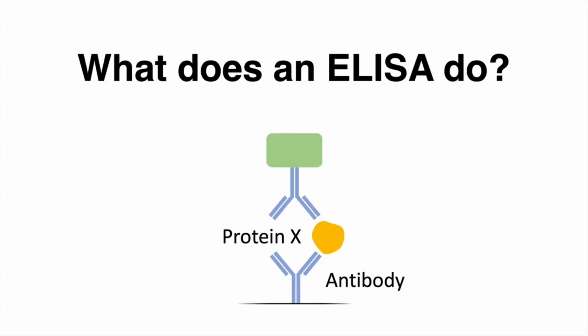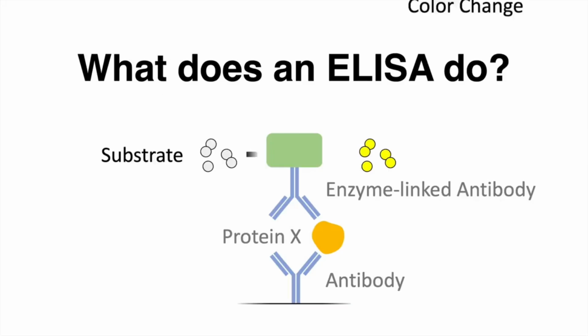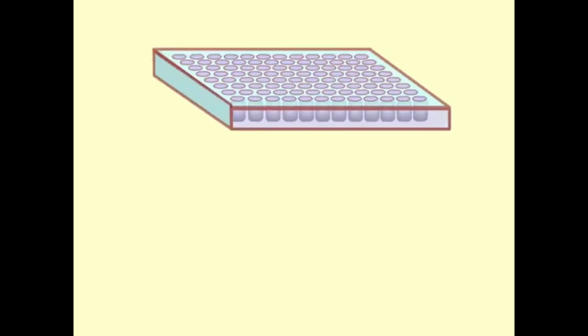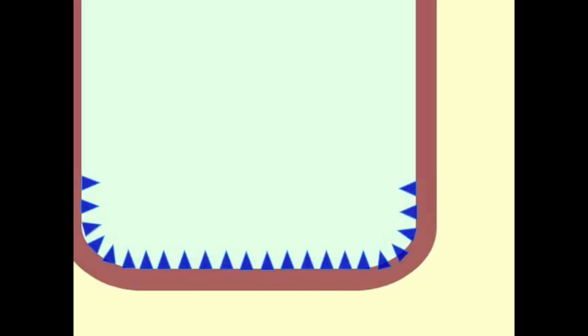To detect the molecule, an antigen and antibody is labeled using enzymes. An antigen in the fluid phase is immobilized to the solid surface, such as microtiter plates constituting polystyrene, polyvinyl chloride, and polypropylene. Subsequently, the antigen is allowed to react with the specific antibody, which is detected by enzyme-labeled secondary antibodies.